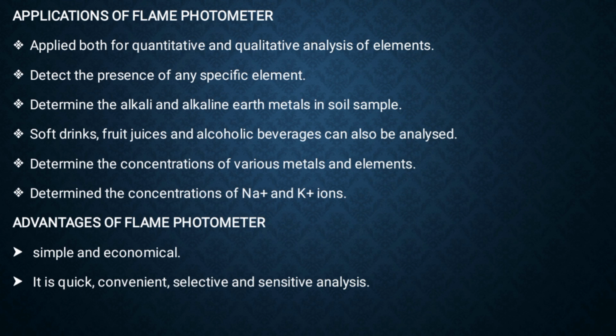Then, with the flame photometer, soft drinks, fruit juice and alcoholic beverages can also be analyzed. The photometer is used to determine the concentration of various metals and elements. Next, we will see the advantages of flame photometer.